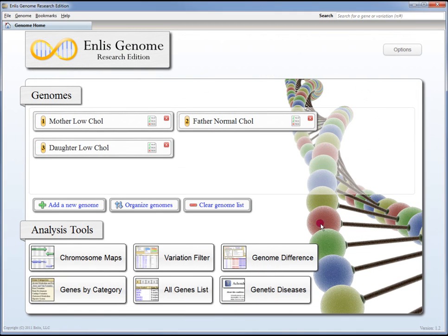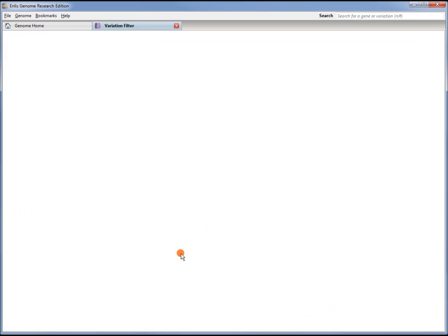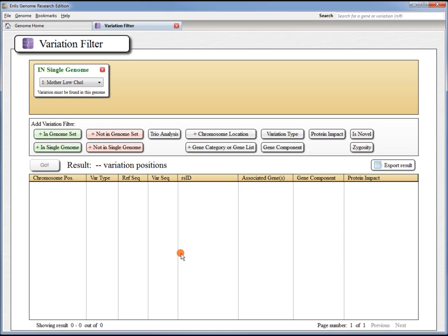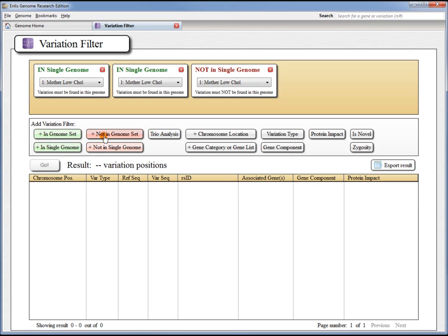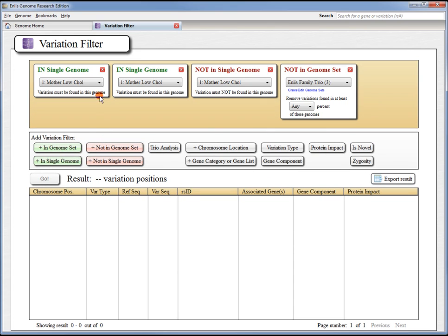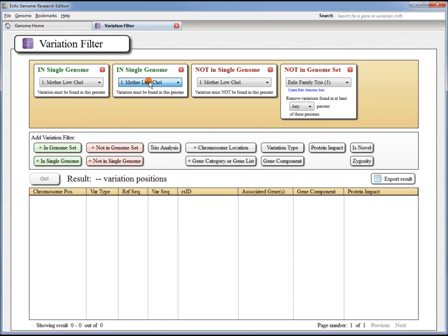So, let's try to find that variation that might be responsible for the low cholesterol phenotype. Let's open up the Variation Filter tool in a new tab. The Variation Filter tool allows you to search many genomes at once and combine different filters to quickly find variations that you're interested in. Let's add a few filters here.